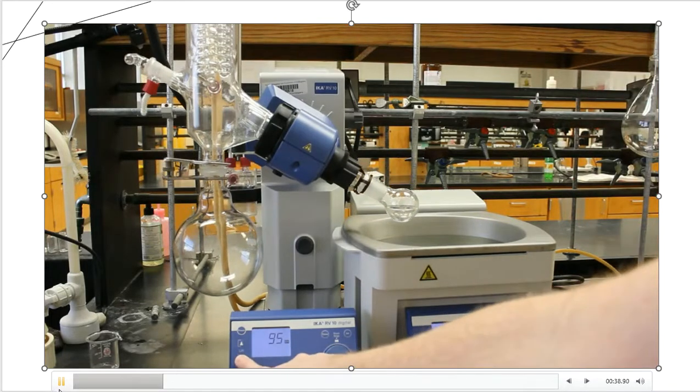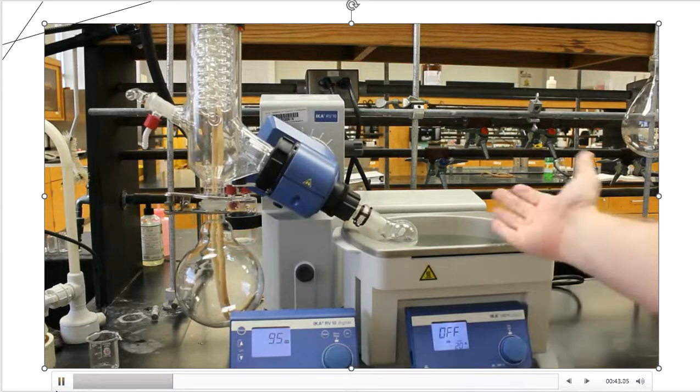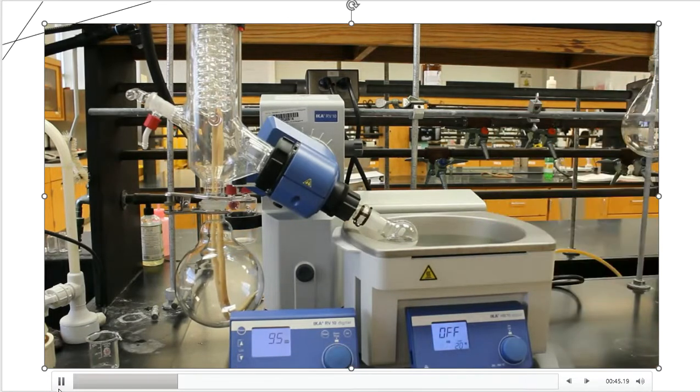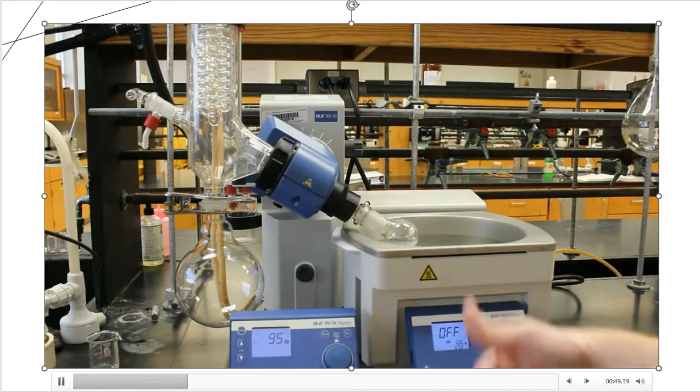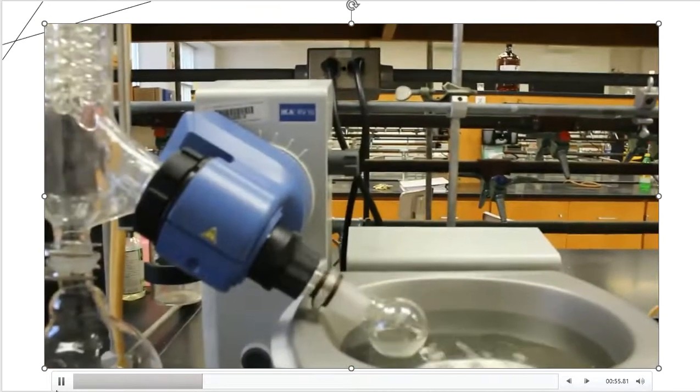I'm going to lower that flask down into some boiling water, and it's not really boiling yet, but it will be soon. And then here on the control panel, I can actually hit start, and that will start turning this boiling flask around and around and around for you.